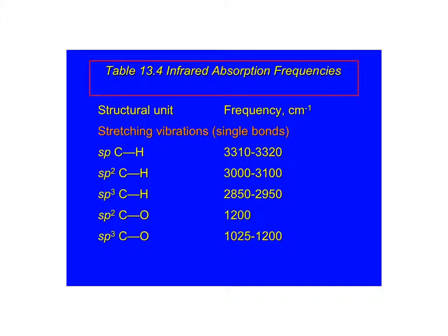What you do is you take the spectrum, and then there are libraries that you would look it up in, and you would say, okay, this matches this type of compound. Or I would give you a table like this, and there's only one exception. There's one functional group that I want you to recognize because it's very unique, and you'll be able to point it out quite easily, and that's the alcohol.